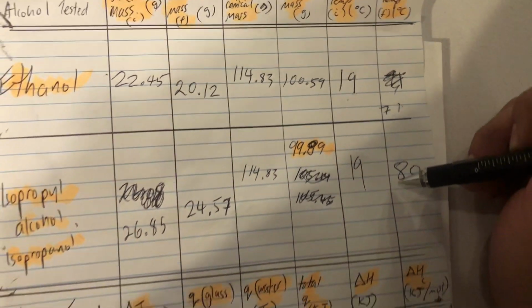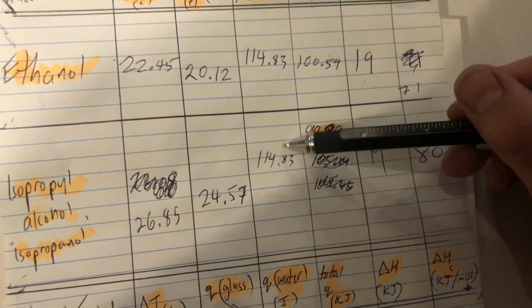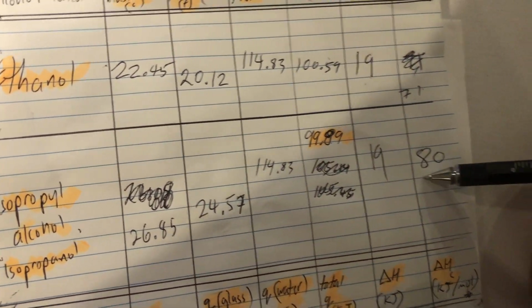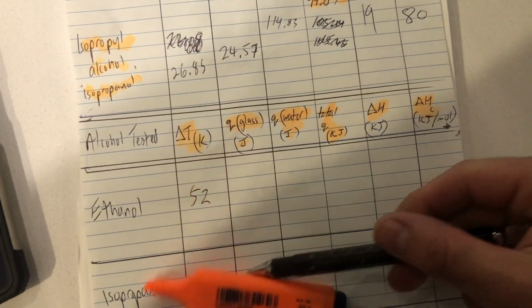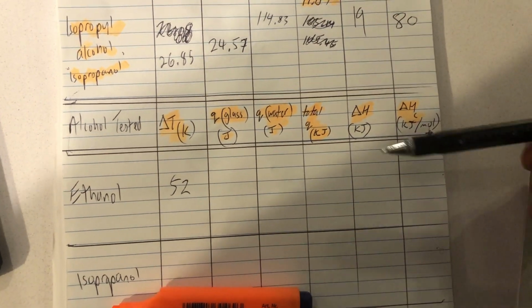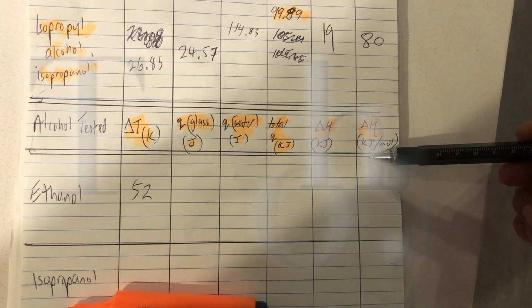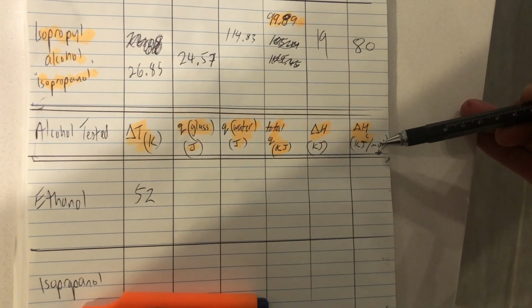You can use your logic and think, well, that means because we had the same amount of water being heated up and the same amount of glass being heated up, we gave it more heat, we gave it more energy. So our Q values should be lower for ethanol, higher for isopropanol. What's going to determine the delta HC though is whether or not the moles was bigger or smaller.